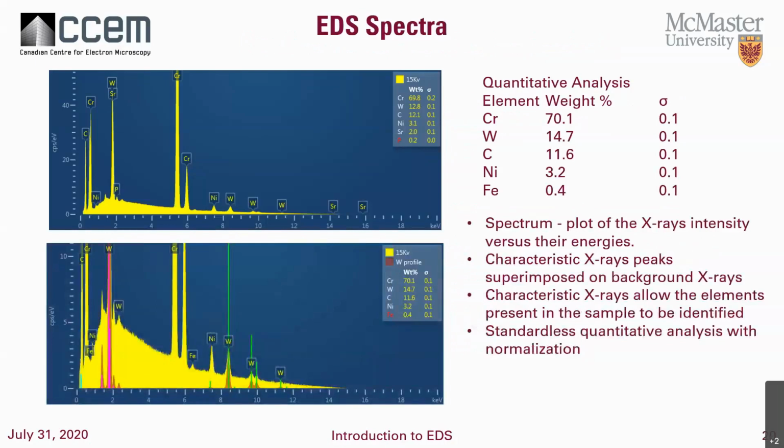So here we can see some EDS spectra, and along with this, we've also done some quantitative analysis. We can see all the various nice peaks. We have X-ray intensity, here in counts per second per electron volt. You could also list it as counts. You can see your background, the nice little whale, as it were, of the background radiation. And we've done the quantification with normalization, so we've forced it to add up to 100% for what's here.